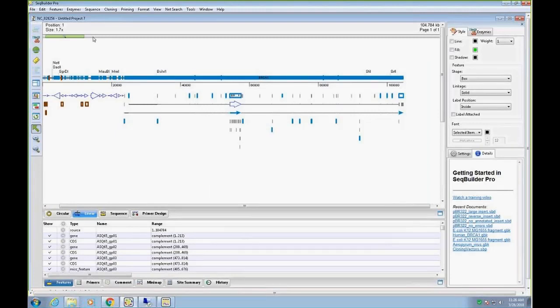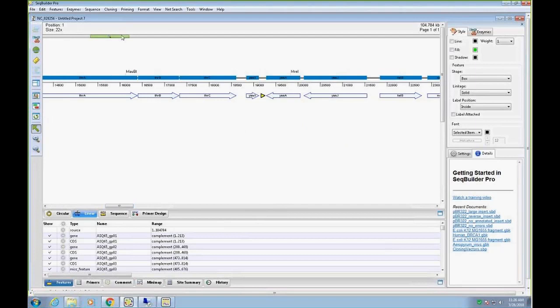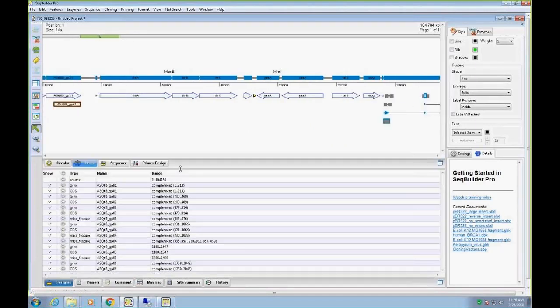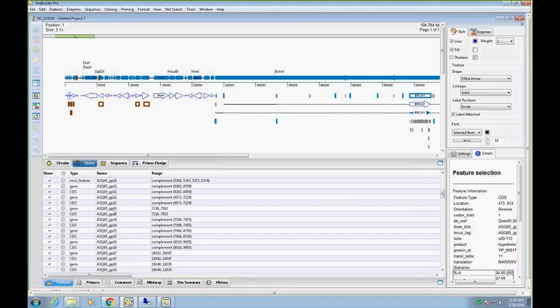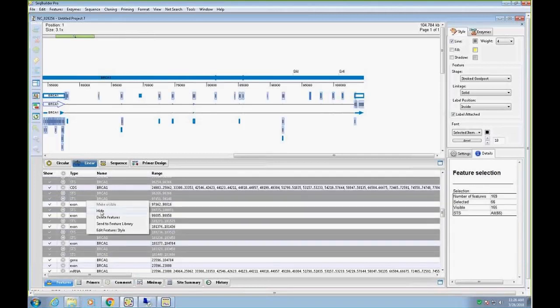And we get, as I said, a feature with a concatenated sequence with lots and lots of features. And so again, some functionality that is new to 15, but not 15.1, is if I decide that's too crowded, I can go into this list, the feature list. And for example, if I want to make the STS features go invisible so I don't see them, I can select them, then select all of that type and hide. So I've just hidden.